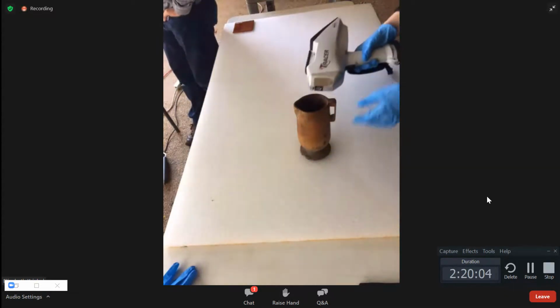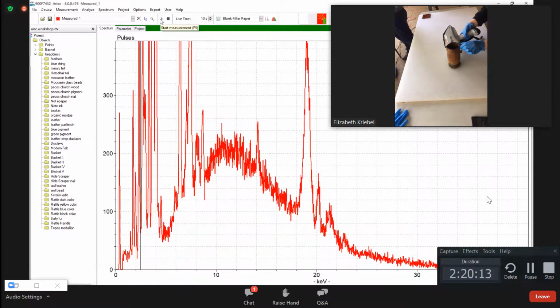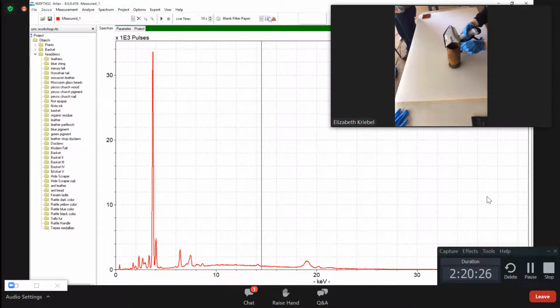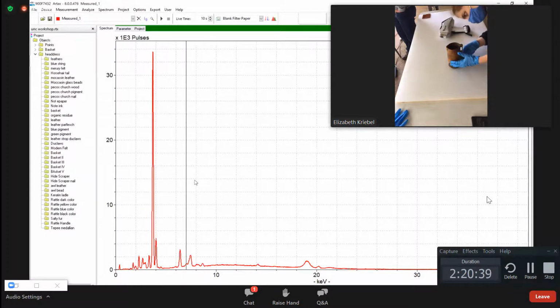All right, ready? Share screen. Ready? All right, starting. So, a lot of calcium, just a ton of calcium. It's a ceramic, so I don't expect it to be treated with anything unusual. Some sulfur too, so maybe a little bit of gypsum on the outside mixed in. A lot more calcium than I would have guessed, but other than that, nothing of concern. Just the sulfur makes me think at least some of it is gypsum. But there's too much calcium for the sulfur. It can't all be. It's a very calcareous mudstone that this is made of.